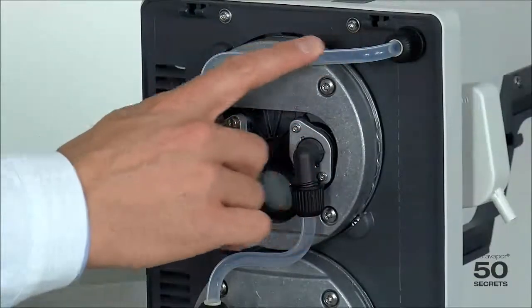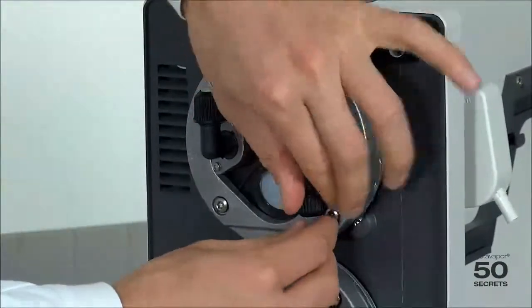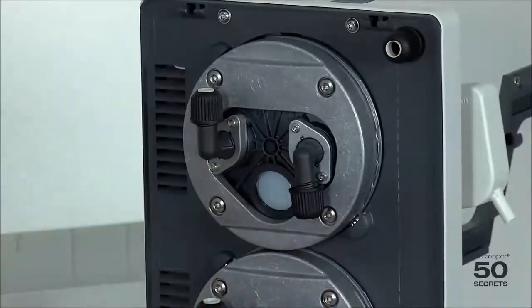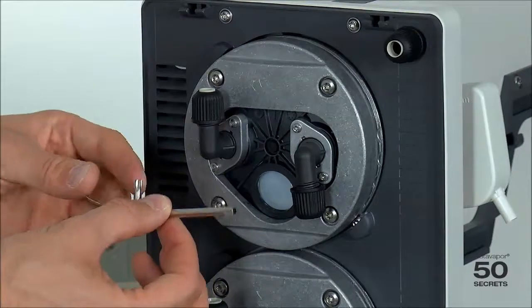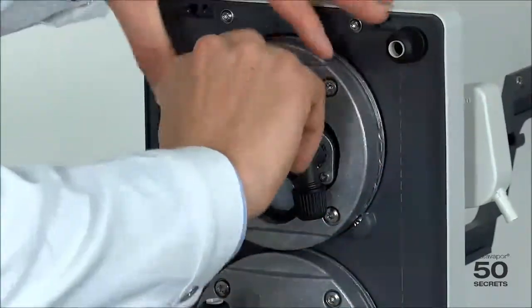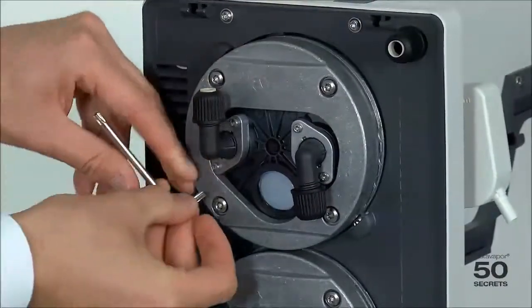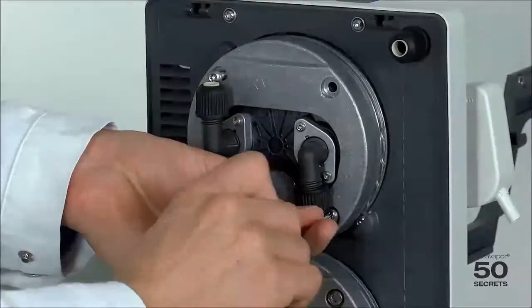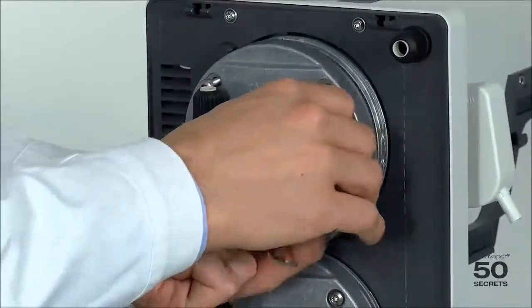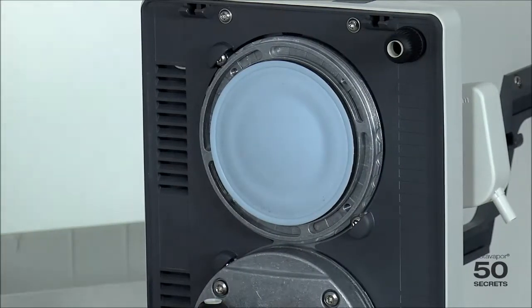Now we first remove the tubes — we just open this a little and open that a little, then take it out. We then use the same Torx 25 and open all four screws. That's how simple it is.